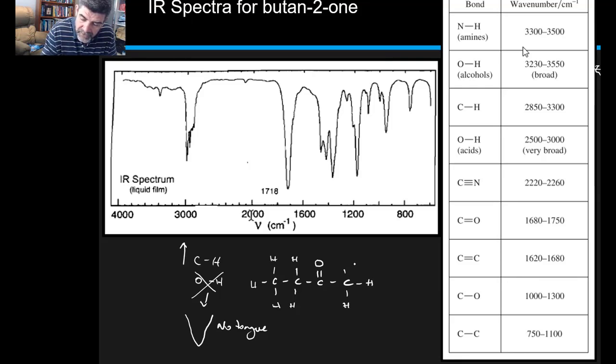Now that we've drawn this molecule, let's see if our infrared display helps us identify all of these things. We've already said that this region around the 3000 mark is our carbon-hydrogen bond, and we certainly have plenty of those.